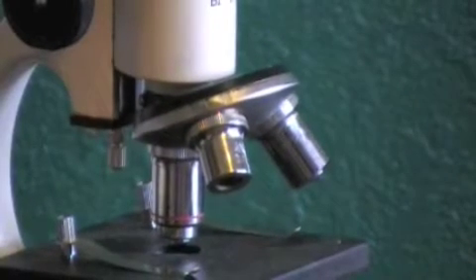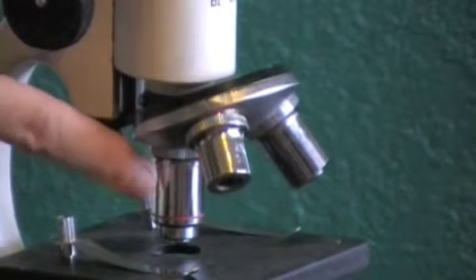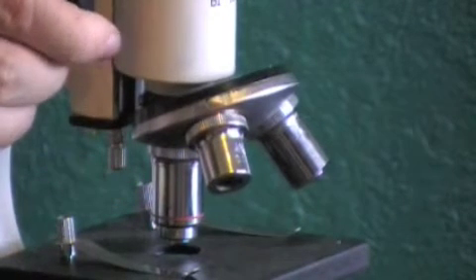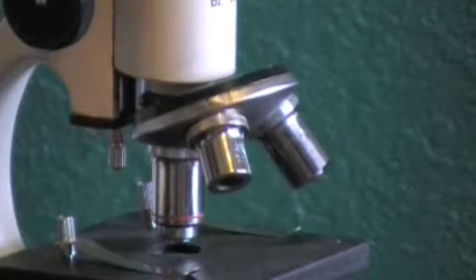If your specimen was in focus with the low power lens, you should be very close to focused with the high power. You may need to move it just a tad, but not much.